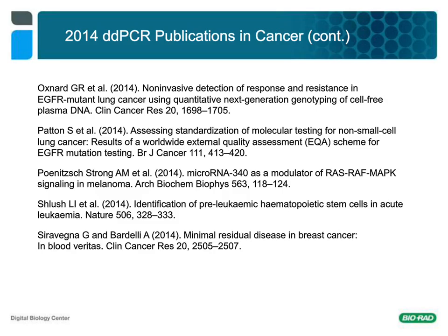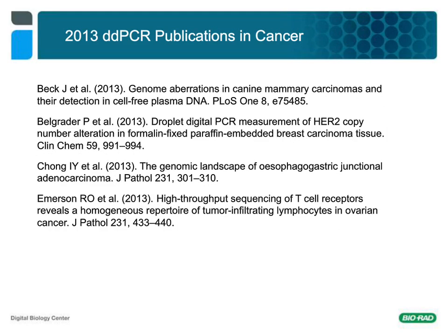Can we sequence the amplified product from ddPCR output? Yes, actually several of our customers are already doing that. It was a rather surprising thing after the release of the first machine that people wanted to do that so quickly. The droplets can be lysed, essentially, and the PCR products purified out and dropped easily into sequencing.